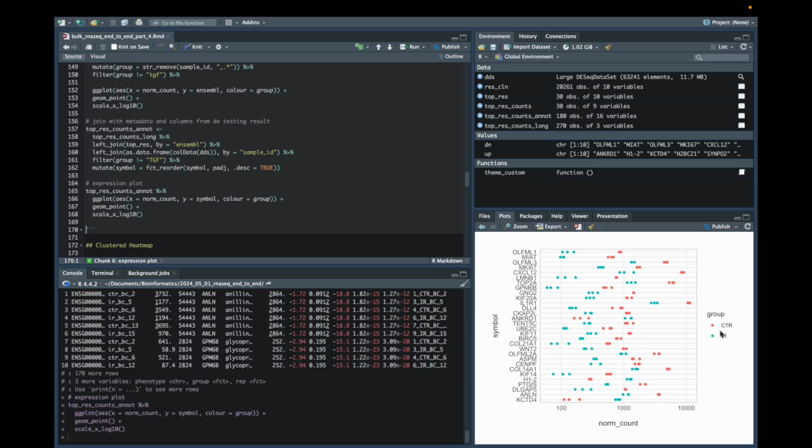So you could check out the blog post for an example of how I've elevated this plot a little further. If you had more data points, you could jitter them, or you could consider adding alpha blending, for example, to the individual samples and adding a mean point with standard error or confidence intervals, or you could use something like a box and whisker plot instead of plotting the individual data points.